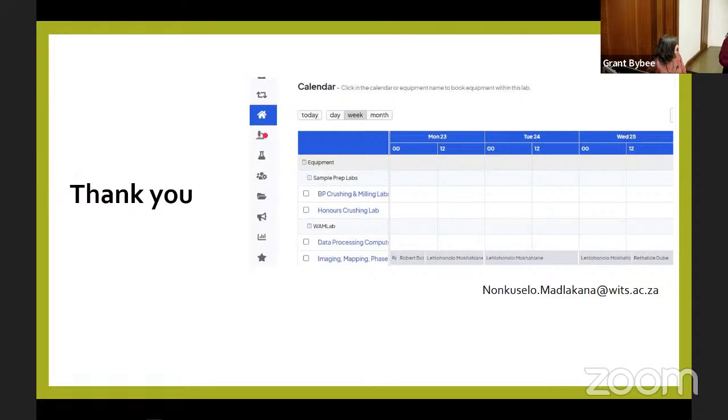That is the sample. I think it will be much better to give the student the opportunity also. Yes. If, when you put the tooth sample into the machine, it took longer for the vacuum to stabilize? Well, honestly, when I put the teeth in, it was the first time I used TIMA, so I don't know if it's longer. But from what I understand, it was not particularly longer.